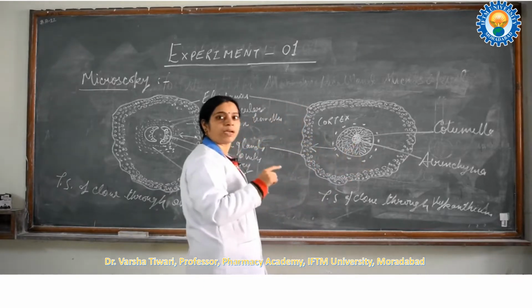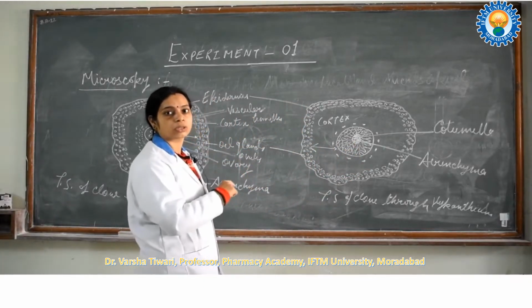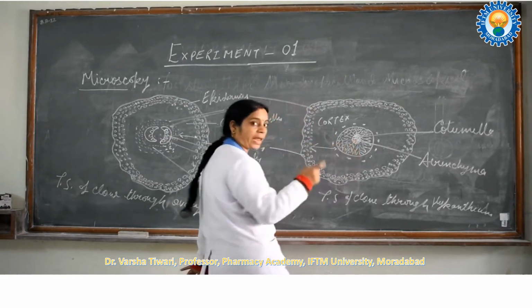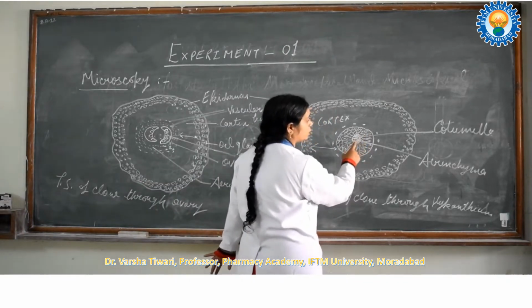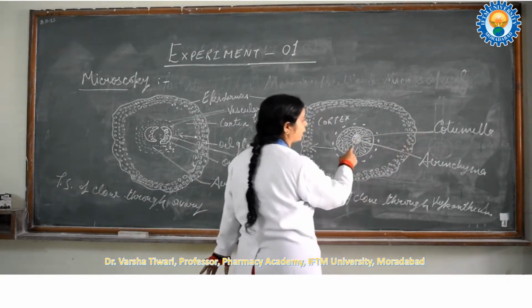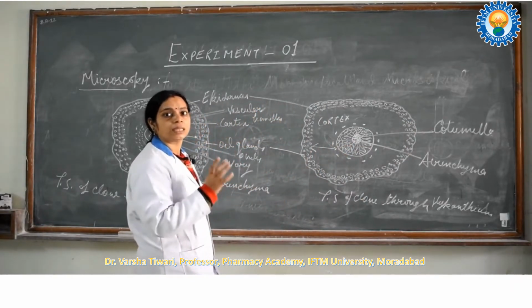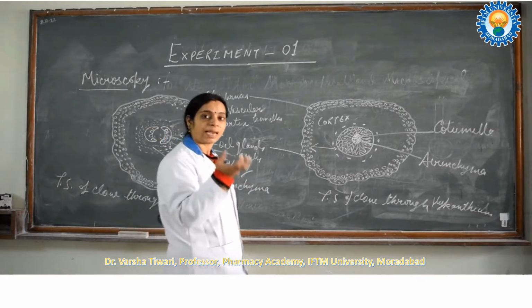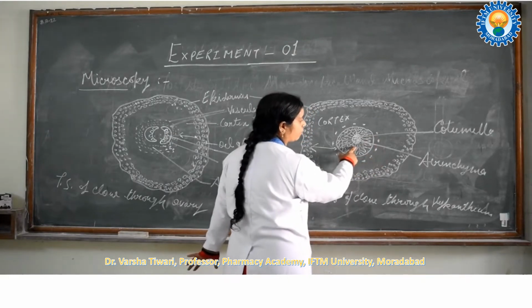So you will identify this section is a section through the ovary and that section is through the hypanthium. In this region, you are going to observe the aerenchymal tissue. In the aerenchymal tissue, the central portion, columella, is present. How are you going to identify the aerenchymal cells? The cells will be at a distance, and light will be coming from that. That I will show you in the TS.